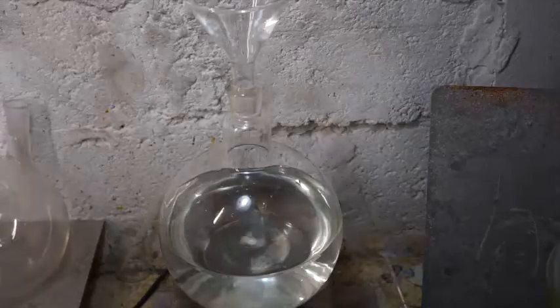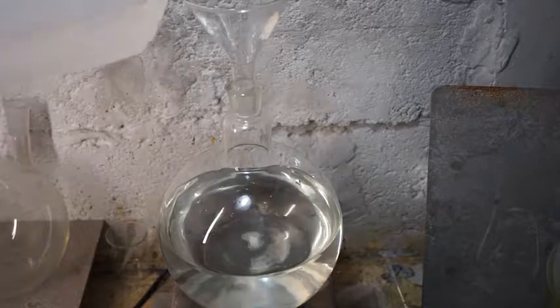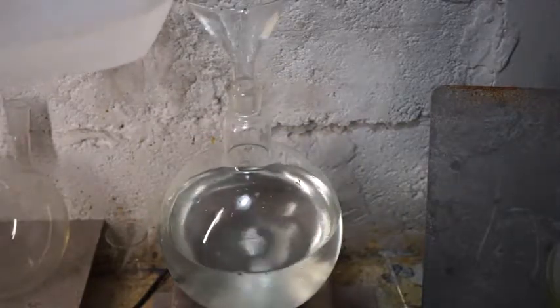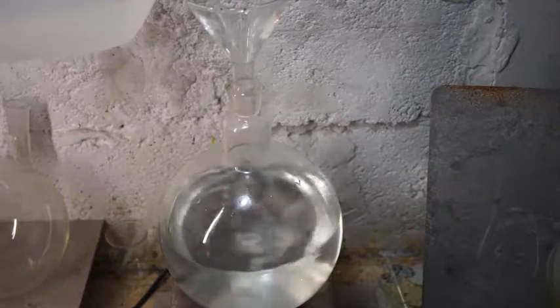I believe the prolonged mixing duration may have been a result of the container I used. So let's add another 1500 milliliters of distilled water and watch what happens.